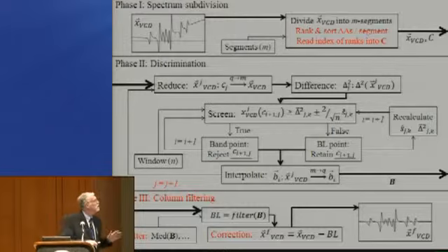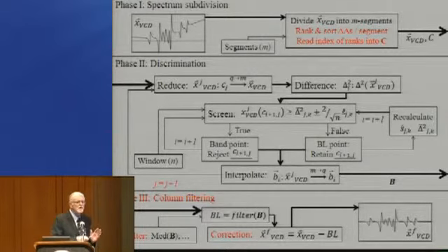So at this point, now I had to start thinking. I knew I had this talk coming up, and we started thinking about VCD, and was there a better way of handling bipolar spectra beyond what was published? Everything that I showed up till now was in that paper in the May issue of last year's Applied Spectroscopy. And what's in red here is what Andy did to improve this and make it a little more rigorous for bipolar spectra.